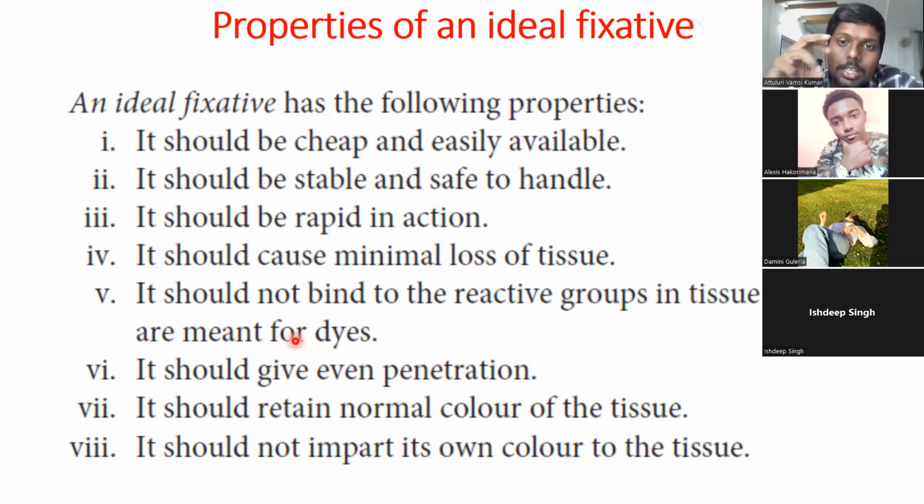It should be able to retain the normal color of the tissue, and it should not impart its own color to the tissue. Say, for example, if the fixative is yellow in color, upon immersing the tissue in this fixative solution, that fixative color must not be imparted to the tissue. The tissue should not become yellow, or whatever color the fixative is.